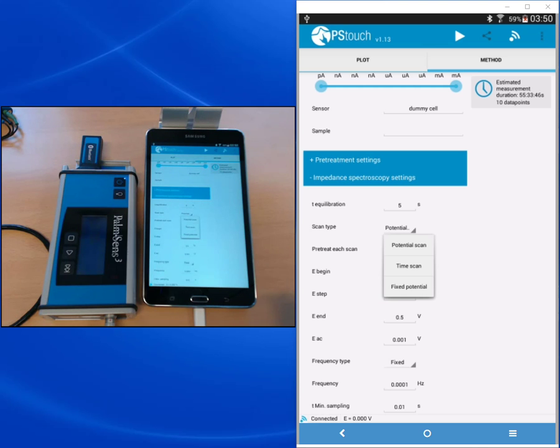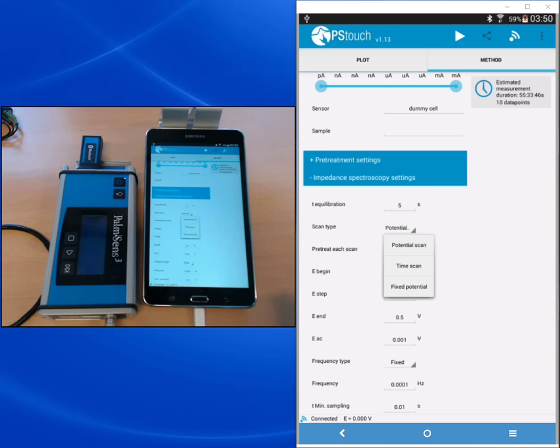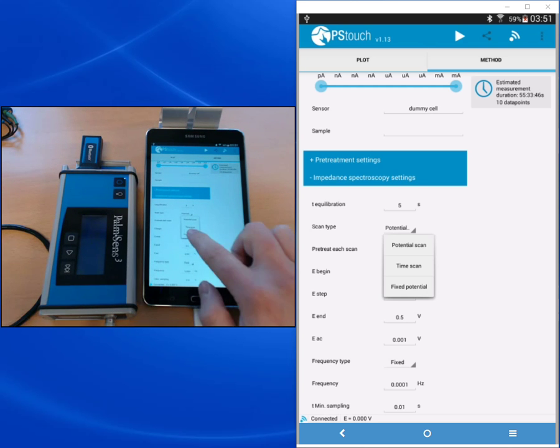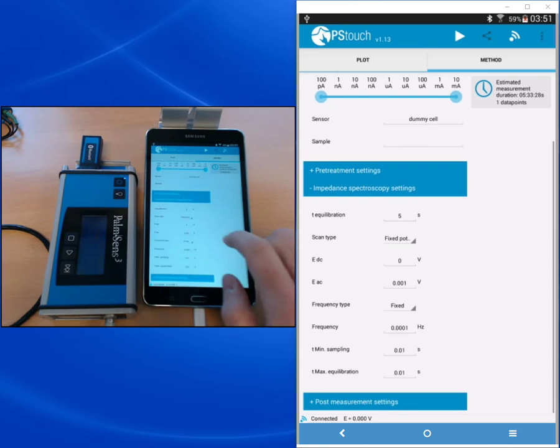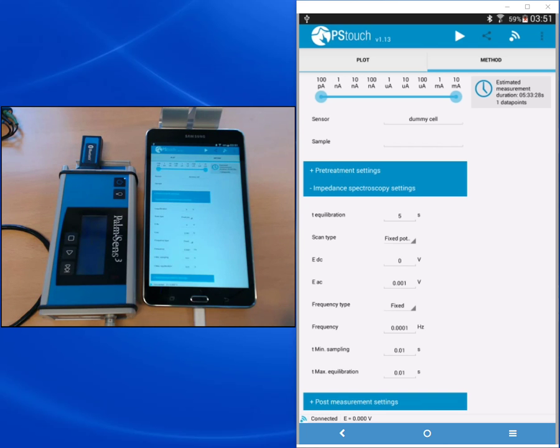Then we have the possibility of a time scan. A time scan means that you repeat your impedance measurement after a certain time interval. This is interesting if you want to observe the change of your working electrode with time. We're going to choose the fixed potential because that's the classic way of doing it.